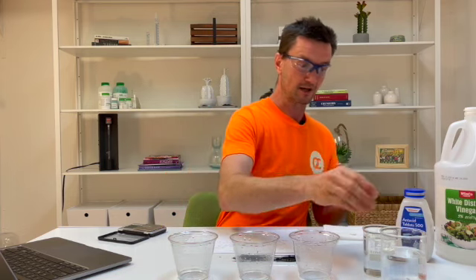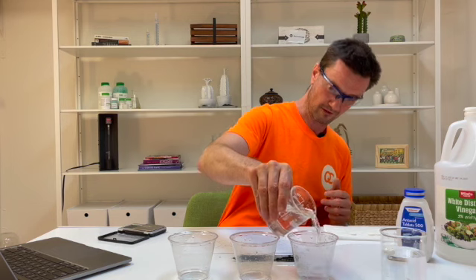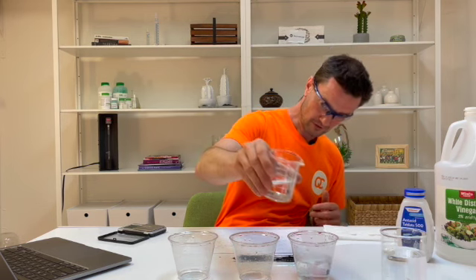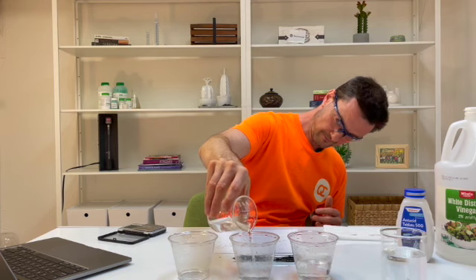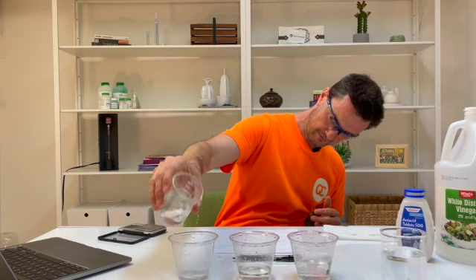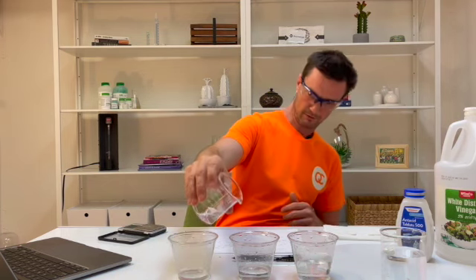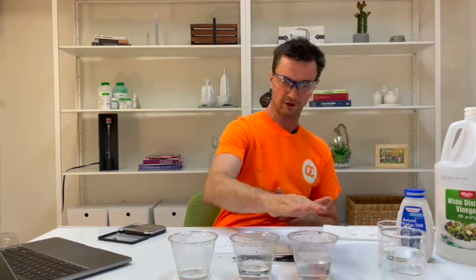I'm going to make 3 solutions of vinegar. One's going to be 100% vinegar, one's going to be 1 part vinegar, 1 part water, one's going to be 1 part vinegar, 2 parts water. So let me make my 100% solution right now. So this is vinegar. So now I'm going to do half that. And then this will be a third of that. Okay. Maybe a little bit more here. And you can see I'm just eyeballing it. Okay, so that's 100% vinegar.